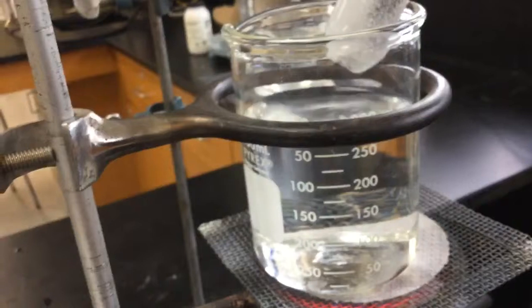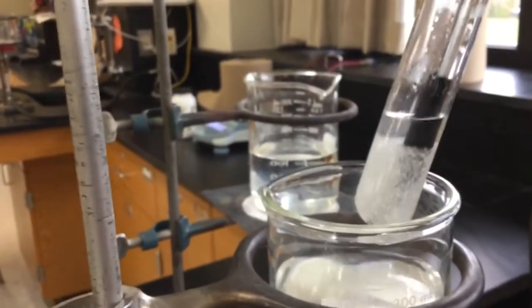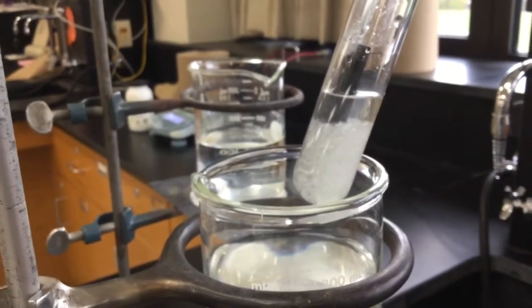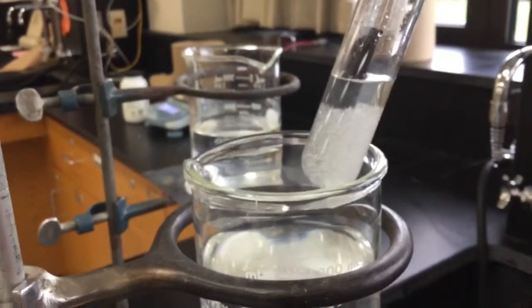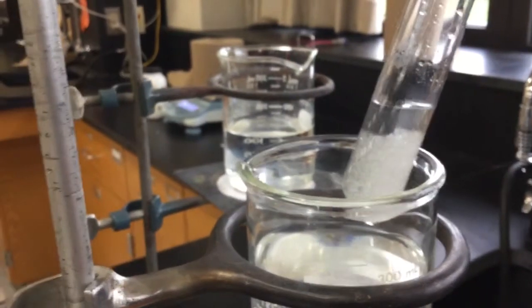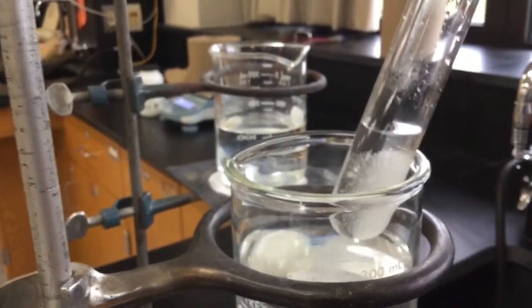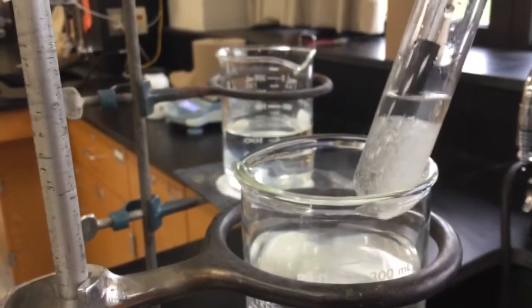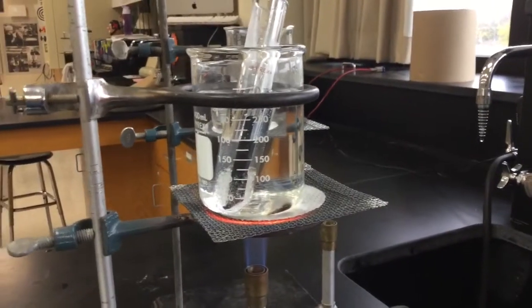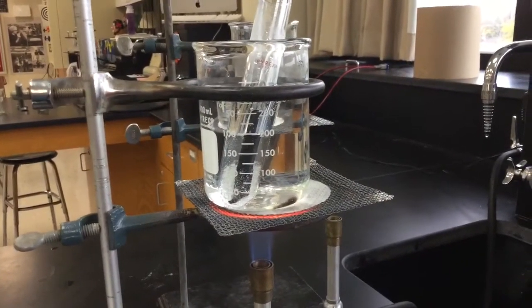A lot of students, when they have all that solute in the test tube, want to say this is supersaturated. This is not supersaturated. Supersaturated is only when you trick it into holding more than it should. If it's just got a bunch of stuff at the bottom, all it is is saturated — it's just holding the maximum, and the extra is just sitting at the bottom. I'm heating it up, waiting for all that solute and solvent to dissolve.